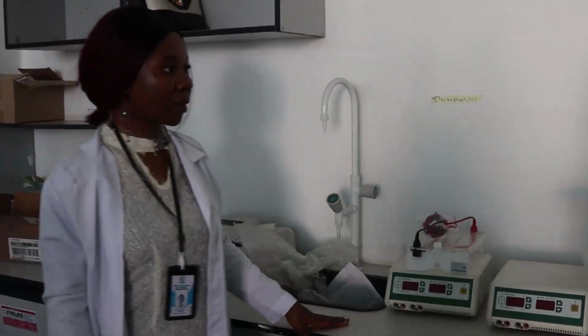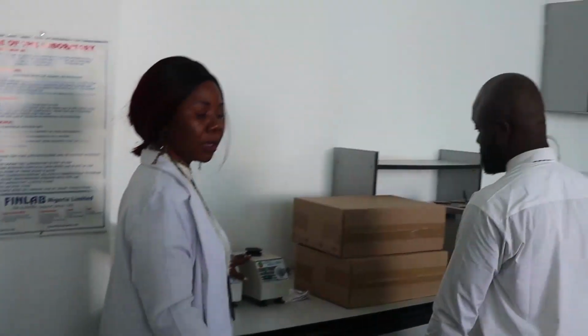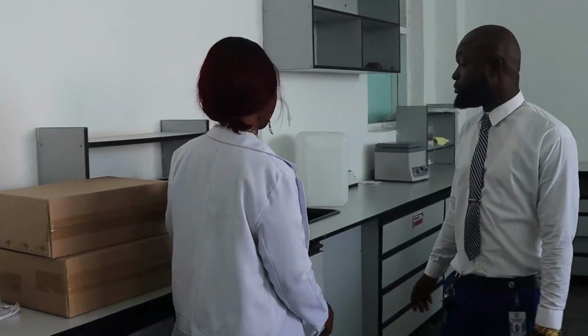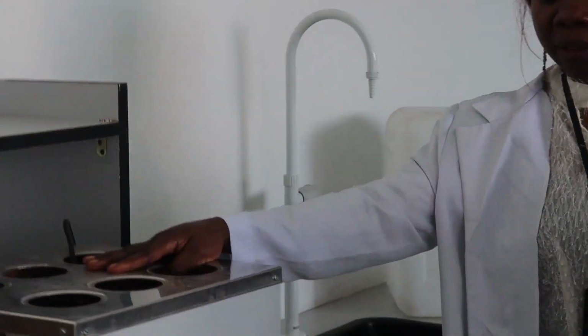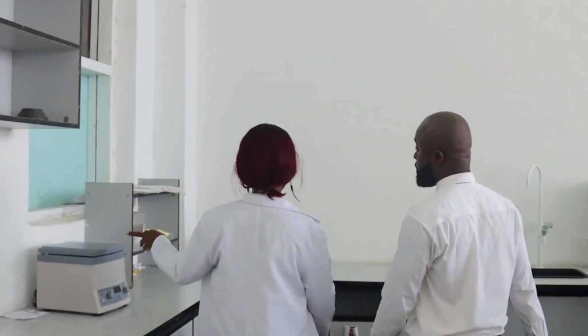Then we have the mixer. We have a lot of them. This is the mixer. We use it for mixing reagents or specimens. We have our water bath as well. This water bath is for those reagents that need room temperature. And then we have our centrifuge.